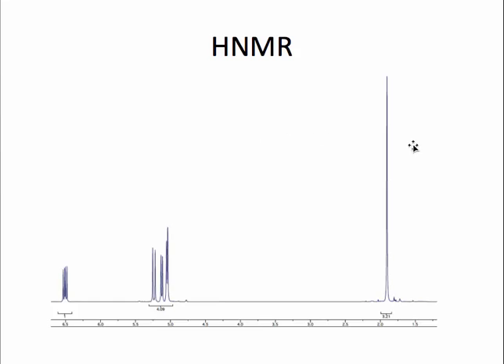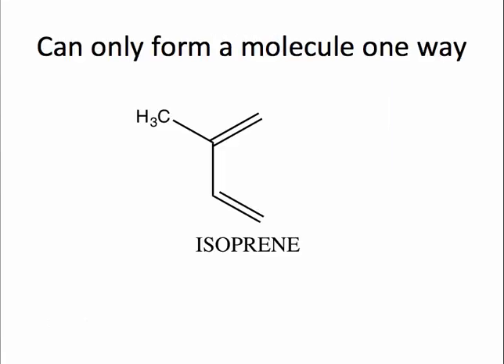And finally, we have a singlet for the methyl group that's not coupled to anything around 2, and our other 5 protons are here. This is maybe a somewhat curious situation in terms of the multiplicity. Luckily, we didn't need it in order to solve the structure, but the reason why it's so complex is that the hydrogens on the same carbon are not identical.